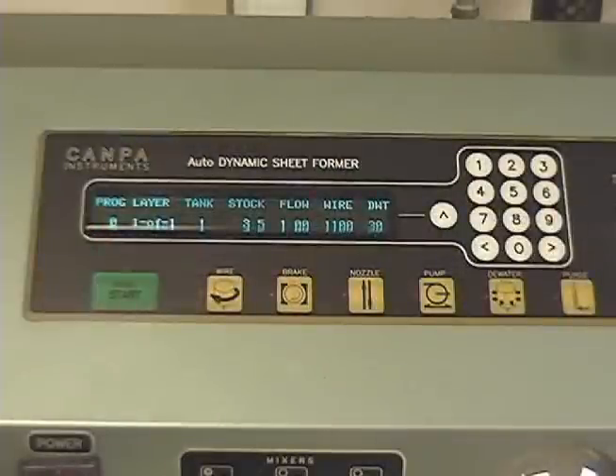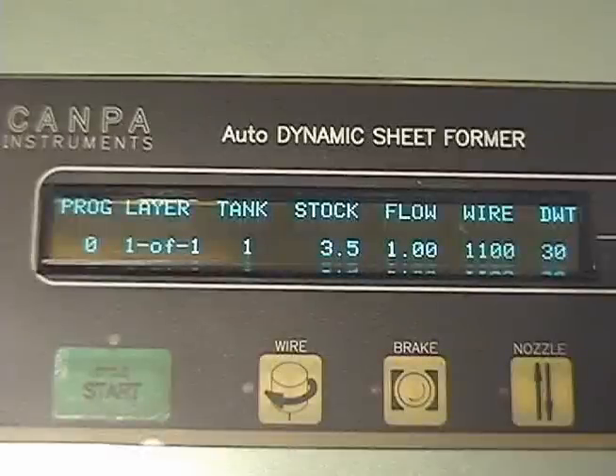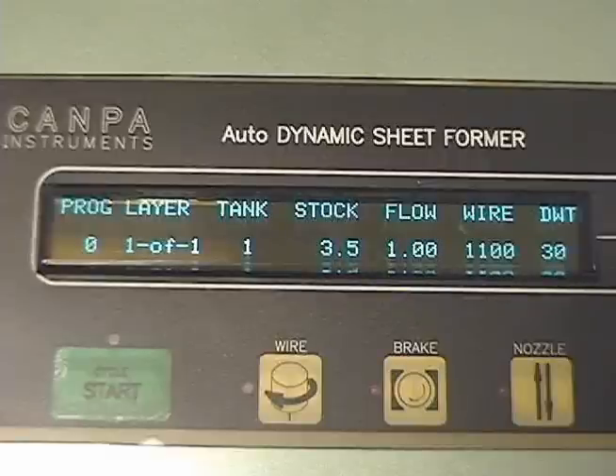The parameters which are routinely changed are contained on the main menu. These include the layer and tank selection, stock volume, stock flow rate, wire speed, and dewatering time. The parameters controlling the paper making process are entered by using the numeric keypad beside the fluorescent display. To change a parameter, simply move the cursor to the appropriate location and enter the desired numerical value. The machine is currently set up to make a one-layered sheet using three and a half liters of stock from tank one. The flow rate will be one liter per minute and the wire speed is set at 1100 meters per minute. Dewatering time will be 30 seconds.